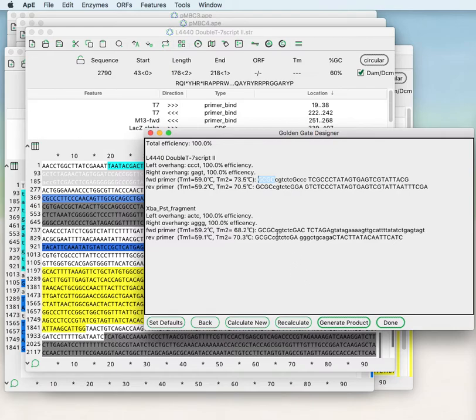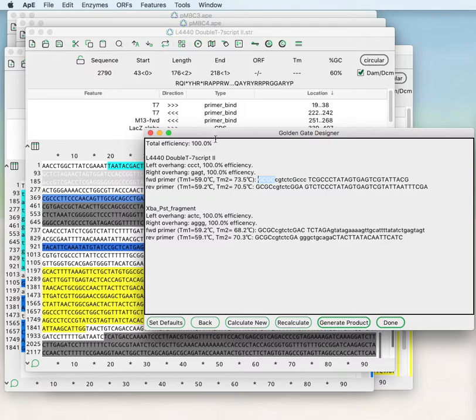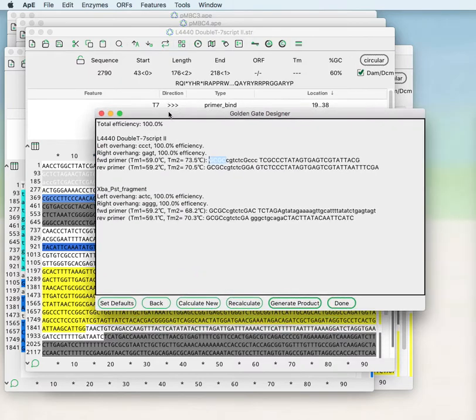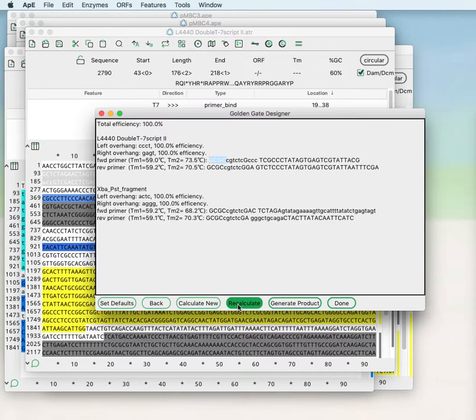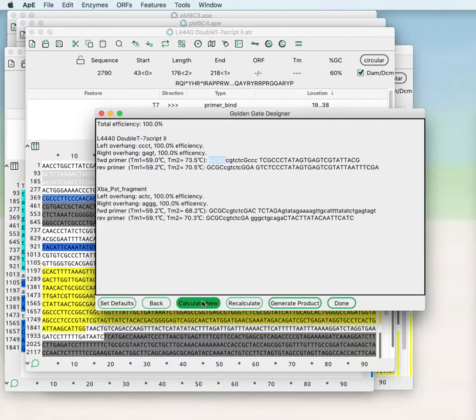Once the primers have been designed and you're satisfied with the efficiency you can generate product. If the efficiency is not 100% you can recalculate from the position that the calculation is in now or you can restart the calculation if it's in a local minimum and sometimes that will get you to a higher total efficiency.